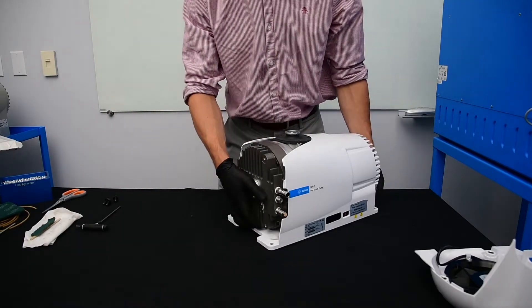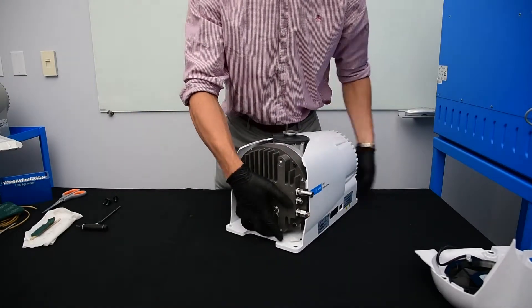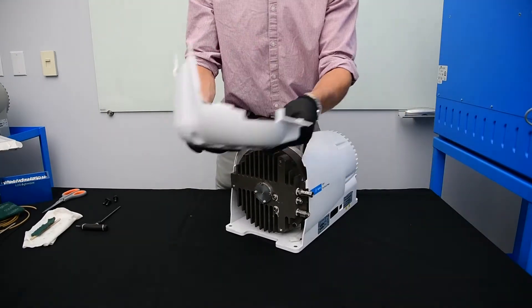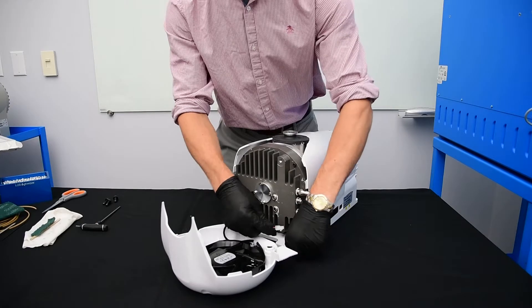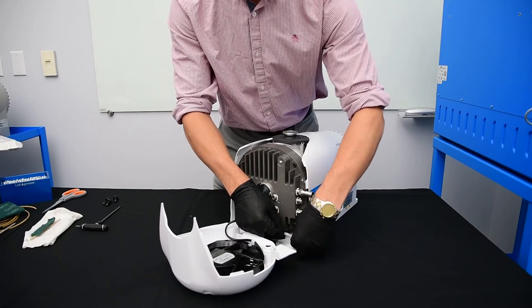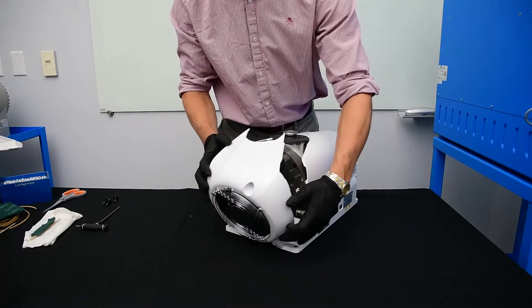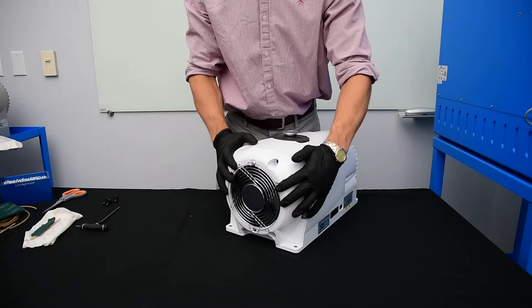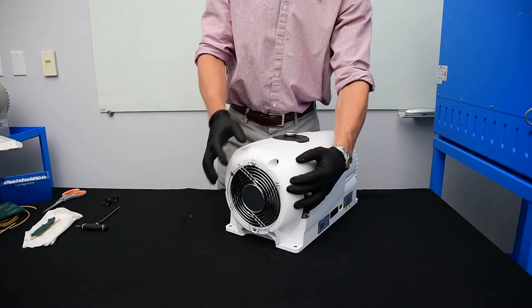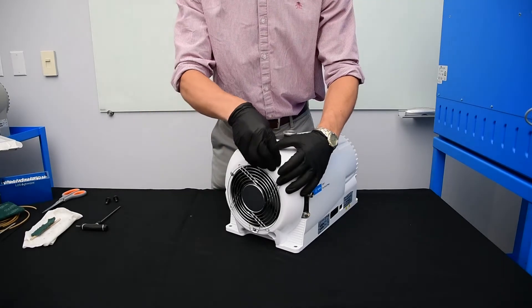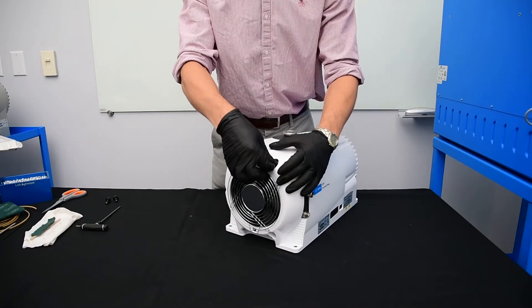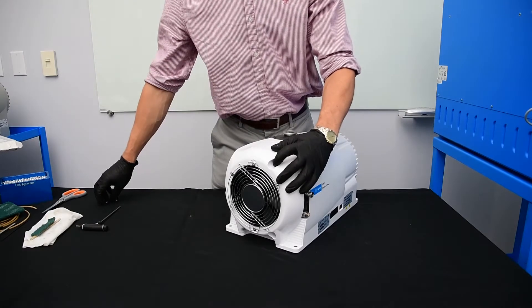Now the outboard housing is installed back on the pump. We're going to get the cowling and the fan back on. Remember to plug the fan back in before installing it. Make sure the cowling slips back in and then grab the three 6mm bolts to put the cowling back on.